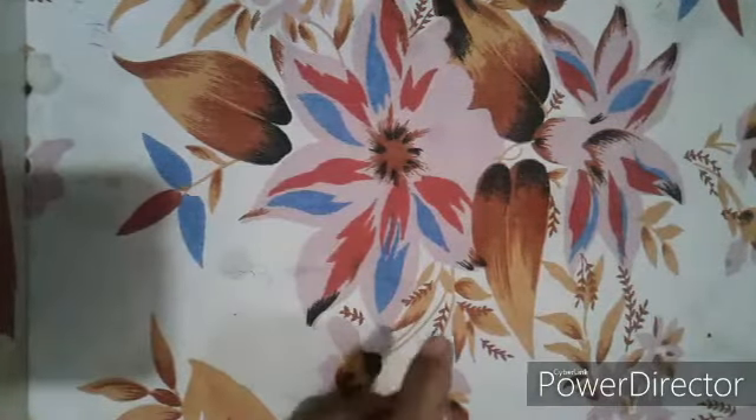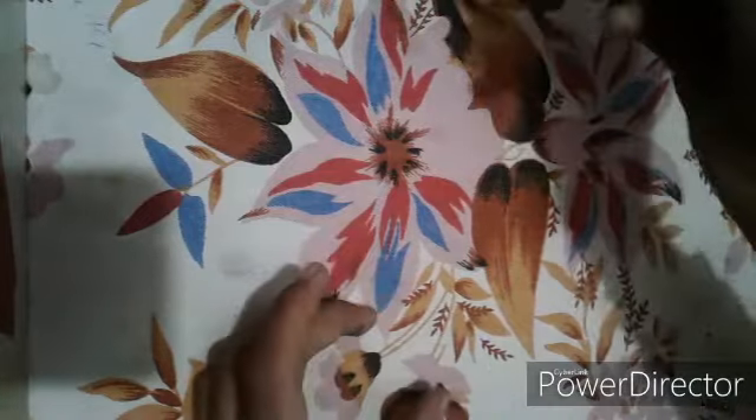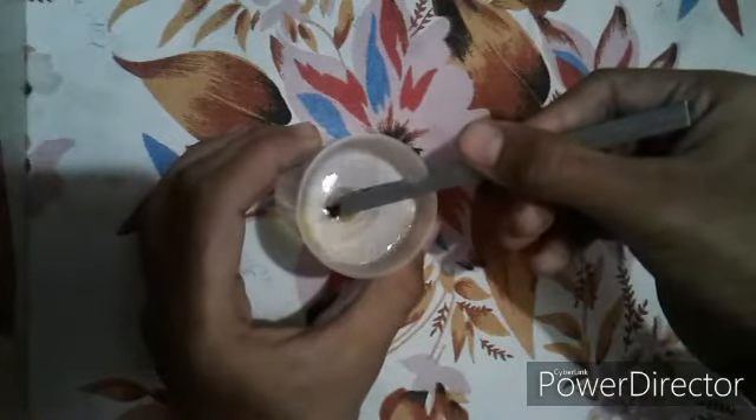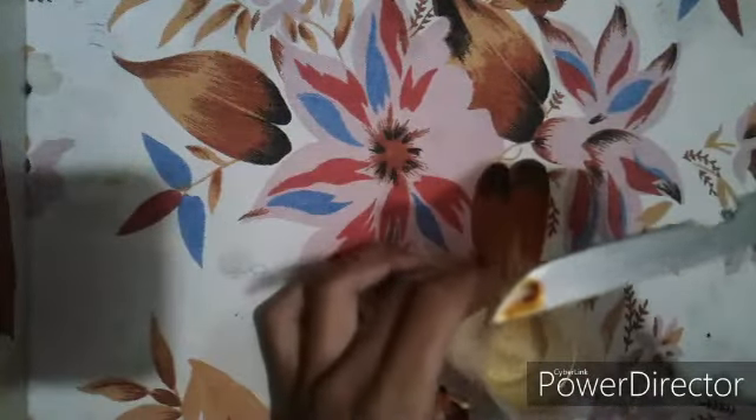We have stained it, and now we are going to remove the excess stain by putting this slide back into the water. You can see that the solution has been removed and this is our stained peel.